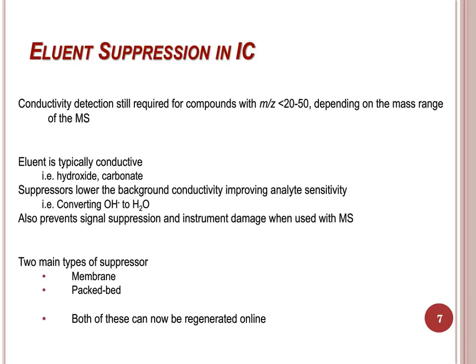Suppressors are arguably one of the most important devices in IC. They lower background noise by removing the highly conductive eluent ions, such as hydroxide, and replacing them to create water. Nowadays, suppressors are either membrane-based or packed bed, which are capable of being continuously regenerated, such as the MSM produced by Metrohm. Not only is this important for improving sensitivity for conductivity detection, but it also prevents damage to the mass spec.